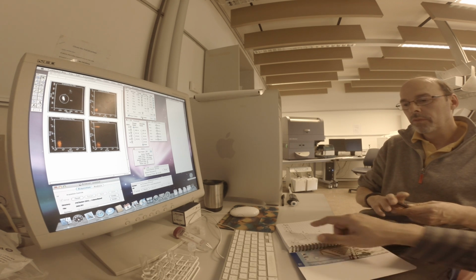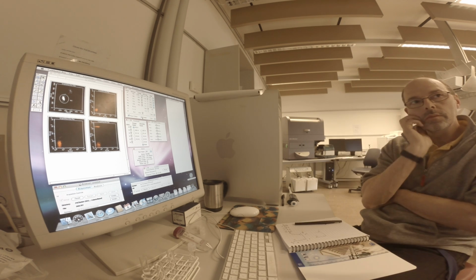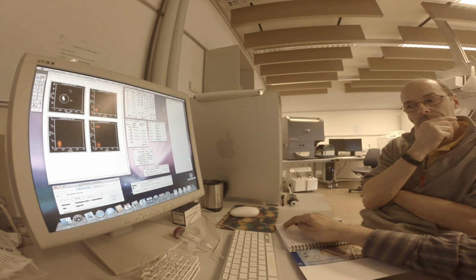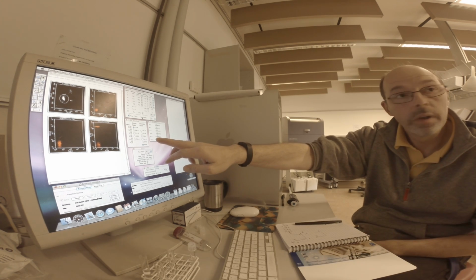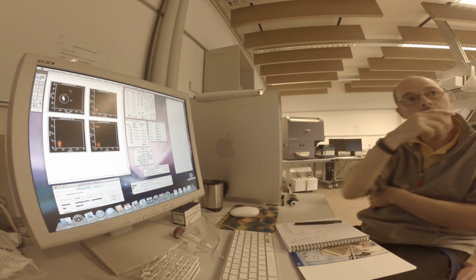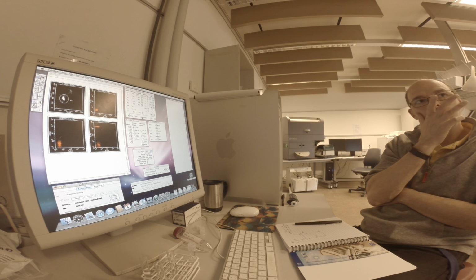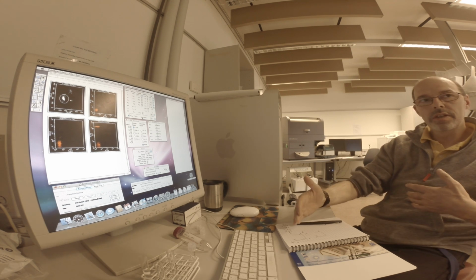And I think it's an important point that I said barely affected. It could be a little bit affected. So we have a little factor on this, isn't it? It will be affected a little bit, yeah. Okay. The equations are not difficult, and adjusting these numbers is not difficult either, because it's simple math. It's simple minus math. 50% or minus 1%.